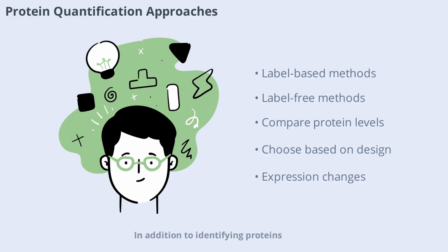In addition to identifying proteins, quantifying their abundance is a key goal in proteomics. There are two main approaches: label-based and label-free quantification. Label-based methods use chemical or isotopic tags to compare protein levels across samples, while label-free methods rely on the intensity of mass spectrometry signals. Each approach has its strengths and limitations, and the choice depends on the experimental design and available resources. Accurate quantification provides insights into protein expression changes under different conditions.